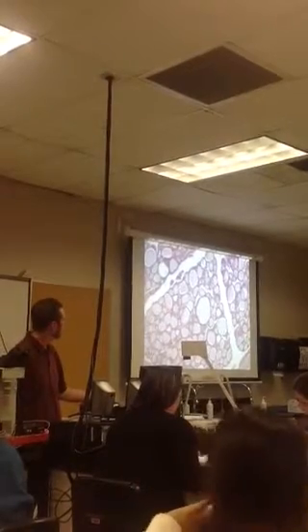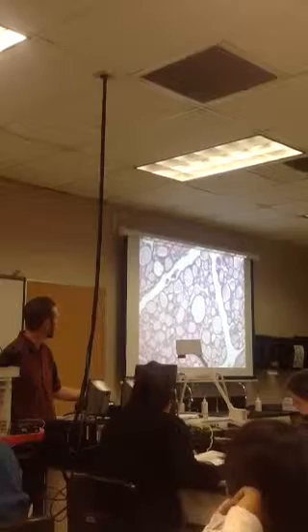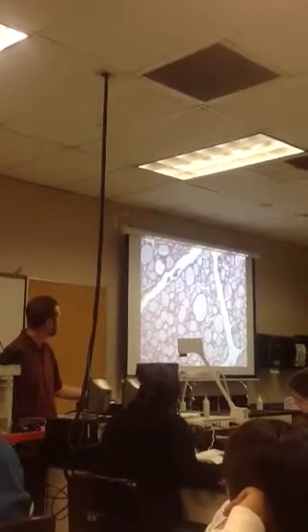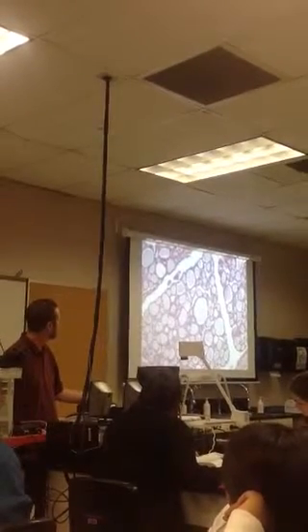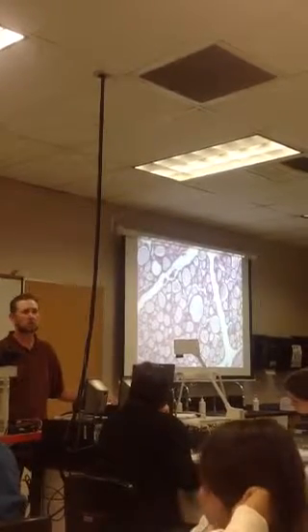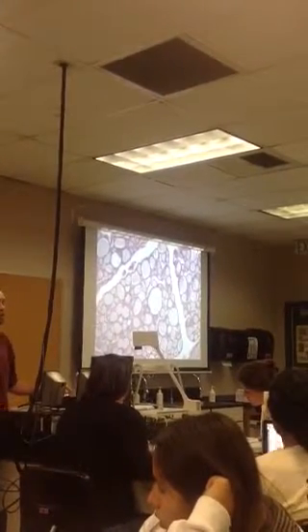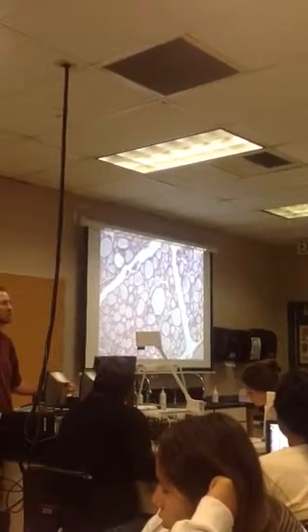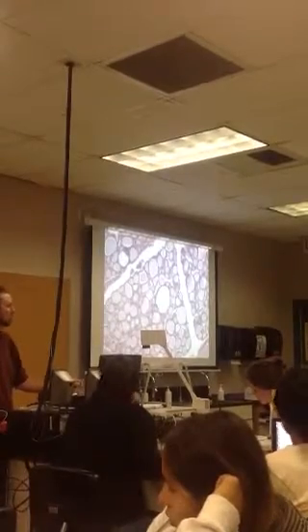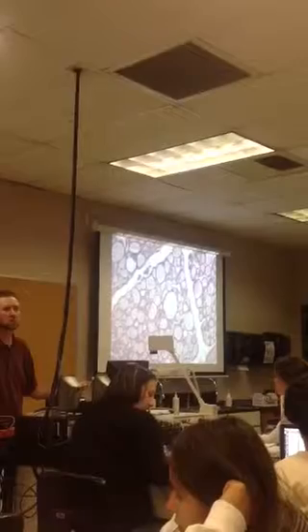And then in between these follicles, you'll see some cells filling up the gaps in between the follicles. All these cells that fill the spaces in between our follicles are called parafollicular cells. And the parafollicular cells have a completely different hormonal function. They produce calcitonin, which plays a major role in regulating blood calcium levels.